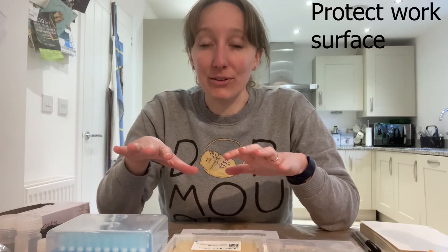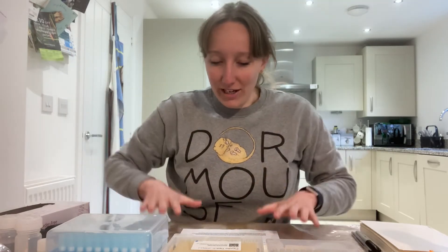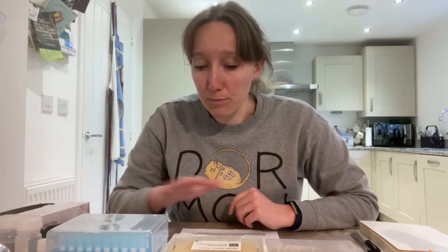Secondly, protect the work surface you're going to be working on. Mine is my kitchen table — a varnished wood surface — and spraying it with disinfectant probably wouldn't be great for the varnish or the wood, which is another reason why I covered mine with sticky-back plastic before I started work, so I can wipe down the plastic without worrying about the surface underneath. Also, if you're using a scalpel to cut up your sample, please invest in a cutting mat — you can then spray and clean that down at the end of your experiment.